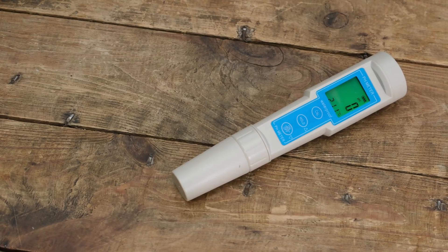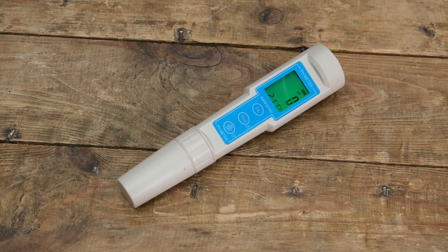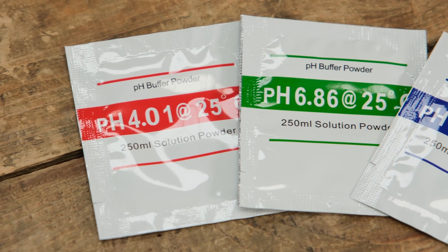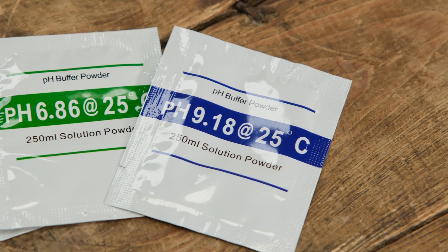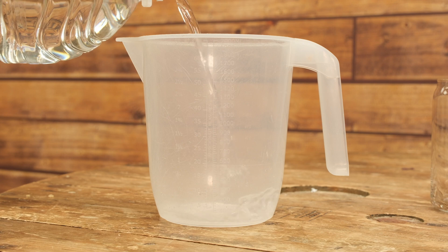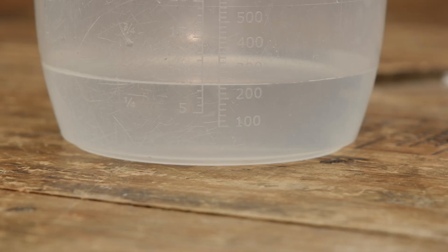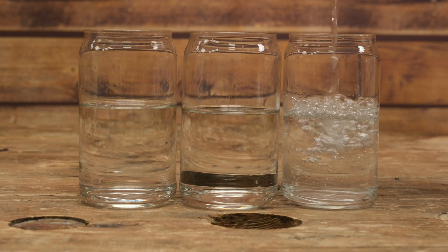So without further ado, let's dive into how to calibrate a pH meter. Calibrating your pH meter is a relatively straightforward process with just a few important steps to make sure you calibrate it accurately. The first thing we need is our buffer solutions — most pH meters come with these in the box, but you can also buy replacements. We're also going to need some distilled water, three equal-size glasses or vials that can hold 250 millilitres, a spoon, and a measuring jug. Measure out 250 millilitres of distilled water into each cup, making sure to accurately measure the volume so it's equal across all three.